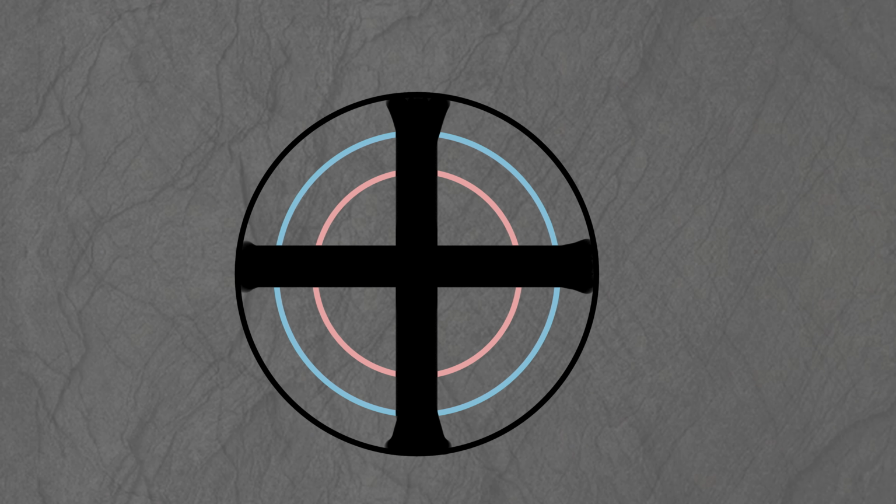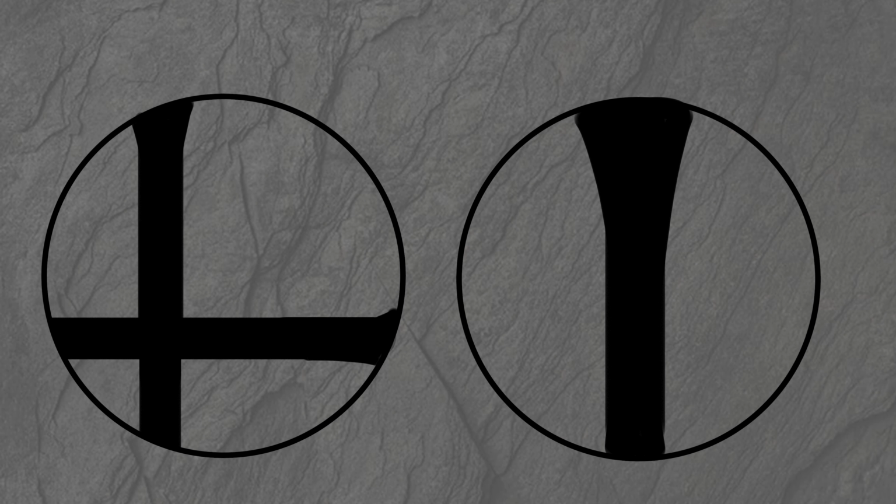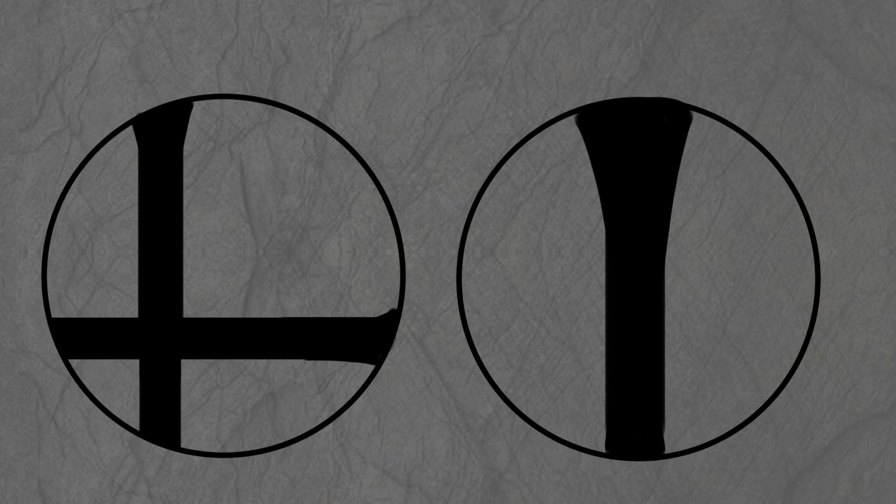You should see an interference figure, such as a centered cross, standard of a uniaxial optic axis figure, or an off-centered cross if your grain is at a low angle to the optic axis. You may also just see a straight line. If this is the case, find a different grain. While you are technically able to use that one, it's not suggested, especially if it's your first time.